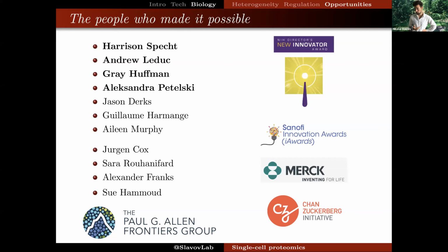Now, we've used another heuristic, not yet published, but we're going to talk about it at the Single Cell Proteomics conference about a month from now. Gray Huffman, a graduate student in my group, has used it. Instead of using this heuristic of picking the most abundant peptides, we can tell the instrument, we have this list of 5,000 peptides of interest. We want to prioritize their analysis rather than just the most abundant peptides. And that's one way, even now, to measure less abundant proteins of interest.